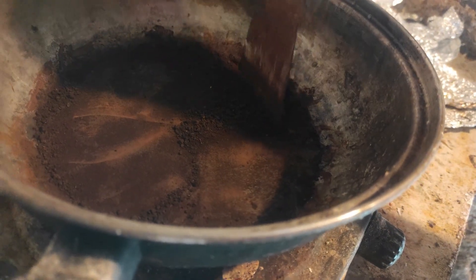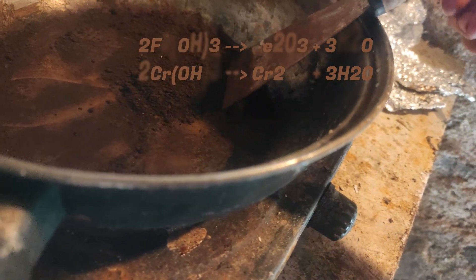After some time, when the sludge contains less water, we dry it on the hot plate. This will convert the metal hydroxides into oxides, and the fine powder can be weighed.